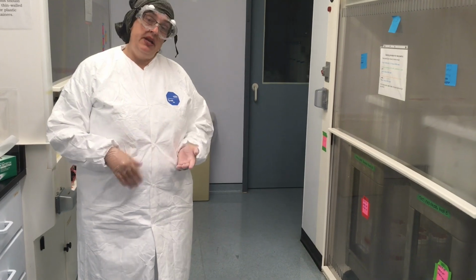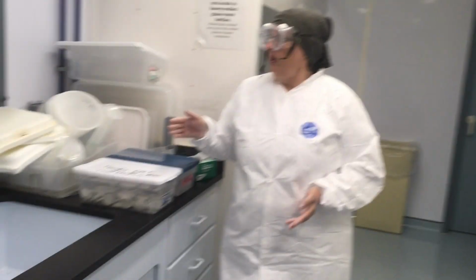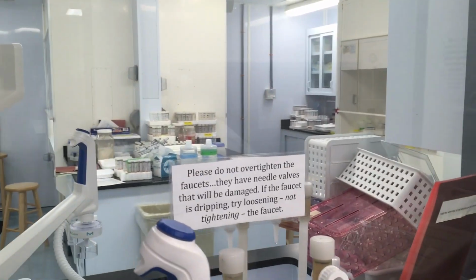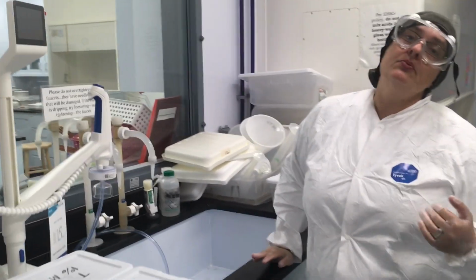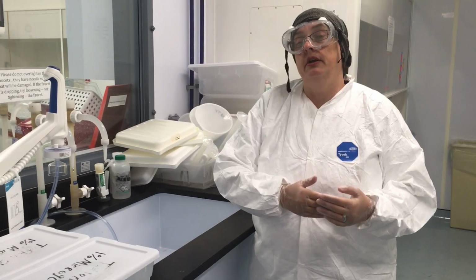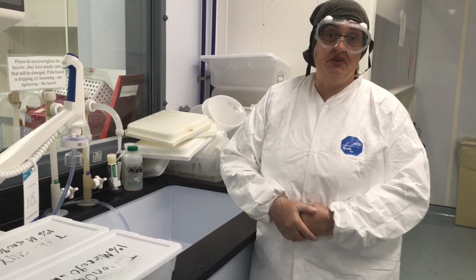So you'll need some training in order to work here, but we're happy to train people and work with you for your project. So this is the main clean lab through the window here, and that has multiple different bays for specific types of chemistry. And because we're a multi-user shared facility, it's very critical that you work with lab staff to make sure that your project is not going to contaminate someone else's. And one of the ways we do that is by separating the different areas of different types of chemistry.